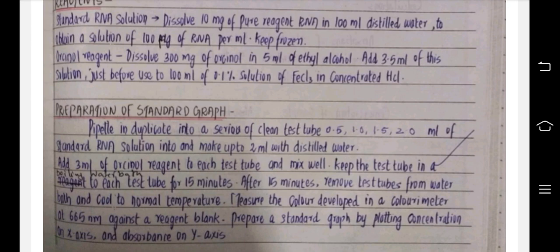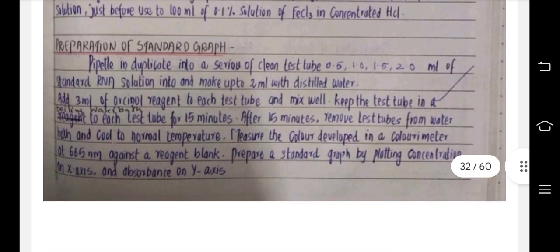After 15 minutes, remove the test tubes from the water bath and cool to normal temperature. Measure the color developed in a colorimeter at 665 nm against a reagent blank. Prepare a standard graph by plotting concentration on the x-axis and absorbance on the y-axis.